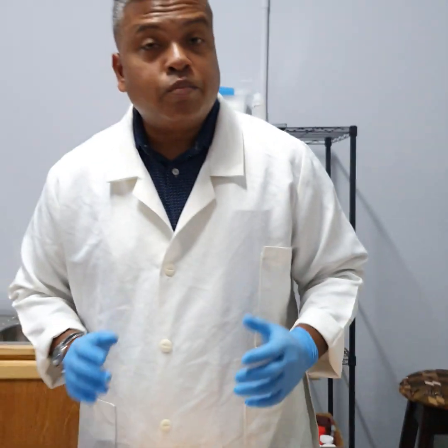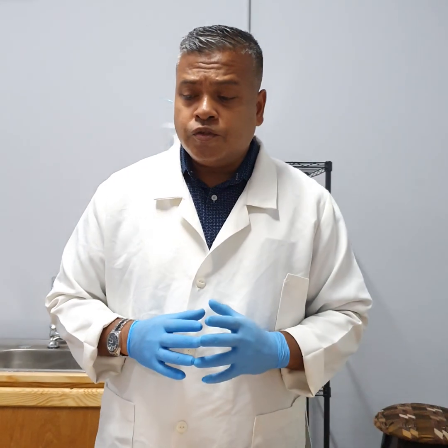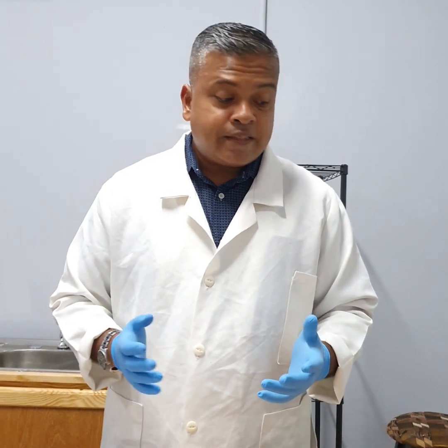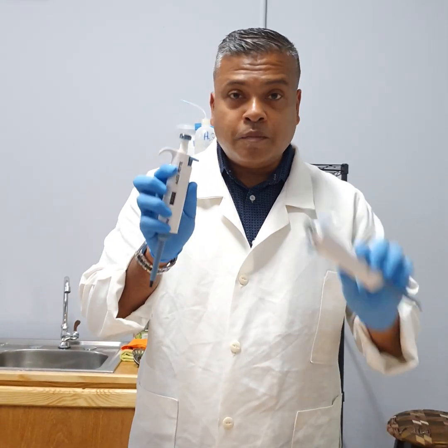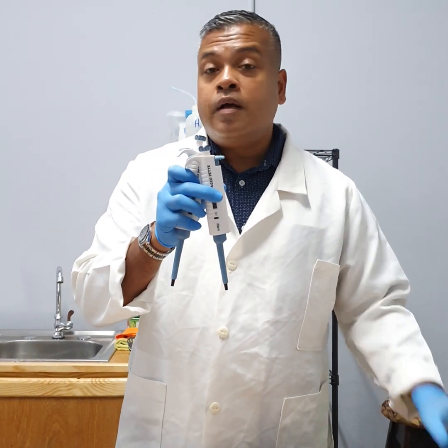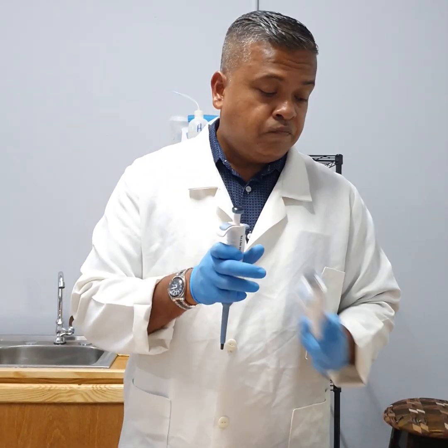So viewers, it is important for us to appreciate and to be aware of, when you go to your laboratory for a particular test, these are some of the fundamental tools that are used in the laboratory to take up, to analyze, to process your tests, such as your cholesterol, your kidney function, your liver function, your prostate cancer screening, whatever.